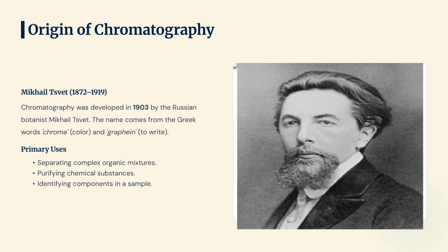Chromatography was developed in 1903 by the Russian botanist Michael Tswett. The name comes from a Greek word, chroma, meaning color, and graphin, meaning to write. Today, it helps in separating complex organic mixtures and purifying chemical substances.